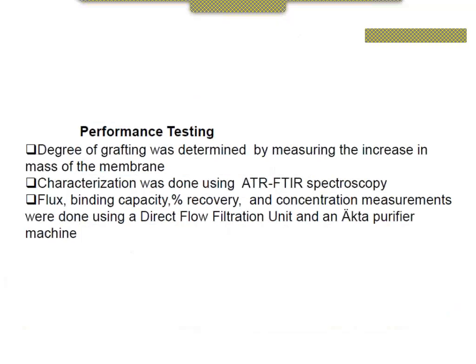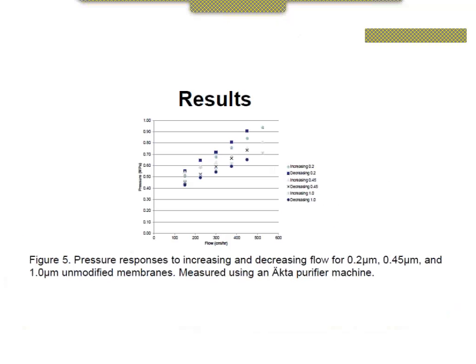So for performance testing of the flux, binding capacity, percent recovery, and concentration measurements, direct flow filtration and an ÄKTA purifier machine were used. And here is data from using an ÄKTA purifier machine, and it shows the pressure responses for increasing and decreasing flow for 0.2 micrometer, 0.45 micrometer, and 1 micrometer pore size for unmodified membrane.